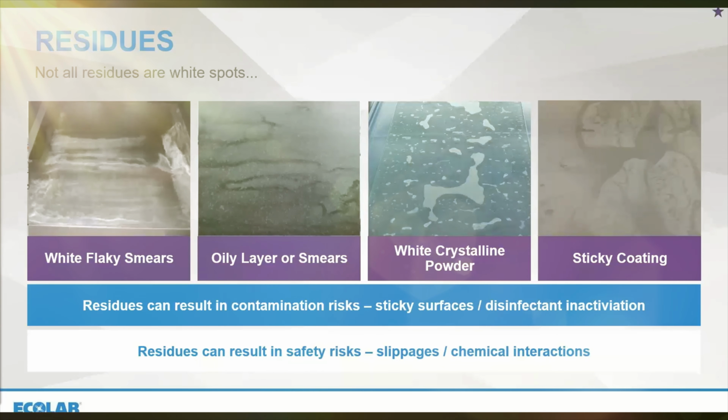And the tighter an organism is bound to a surface, then the harder it is to destroy it with a disinfectant. So we want to avoid unnecessarily attracting organisms to surfaces, and different residues are going to have different interactions with organisms, so we're going to get different physicochemical interactions. So we want to avoid this attractive ability that could exist.